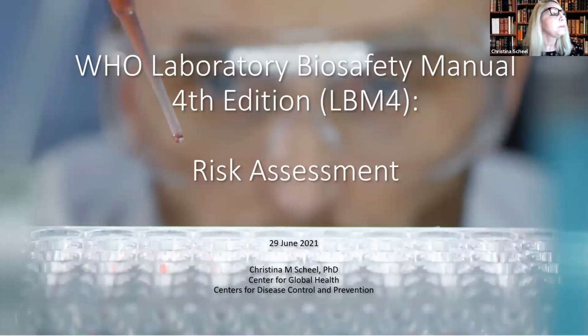Wonderful. So today, of course, I'm going to be talking about the WHO Laboratory Biosafety Manual 4th edition risk assessment, and that includes the risk assessment monograph.